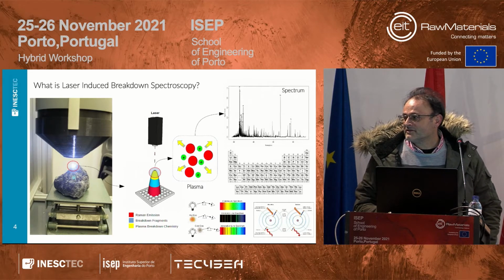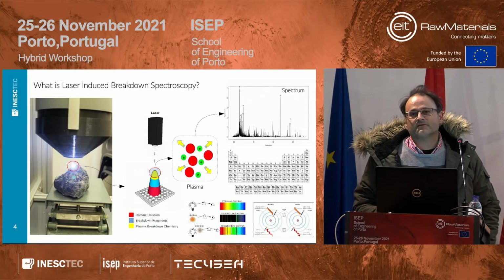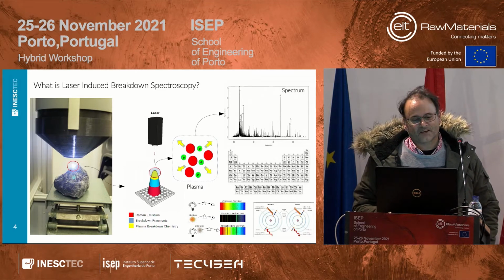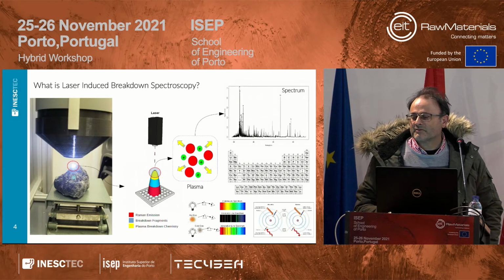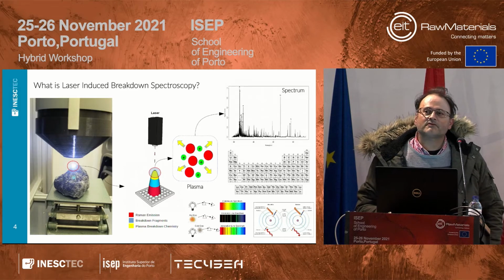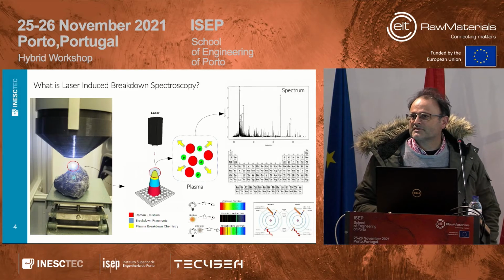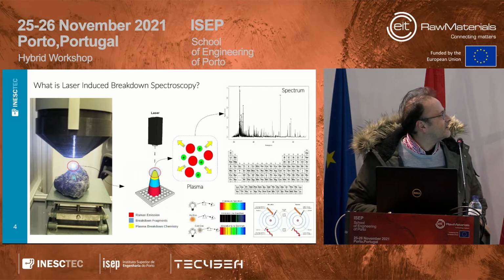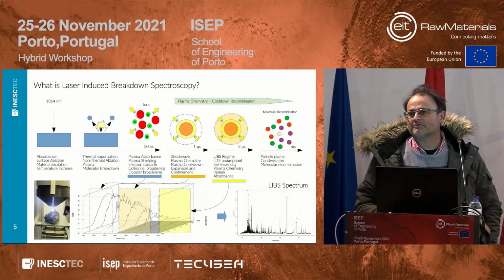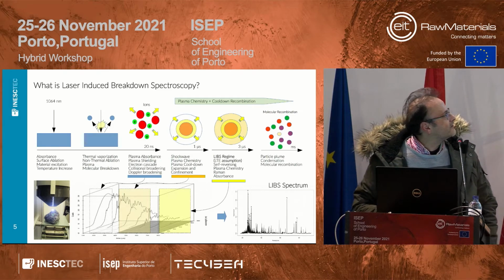If the material is different, and if the laser is different, and the conditions are different, the LIBS spectra will be different. So LIBS is a very divergent information technique between instruments and samples, because the same chemical formulation can have different LIBS spectra observed.